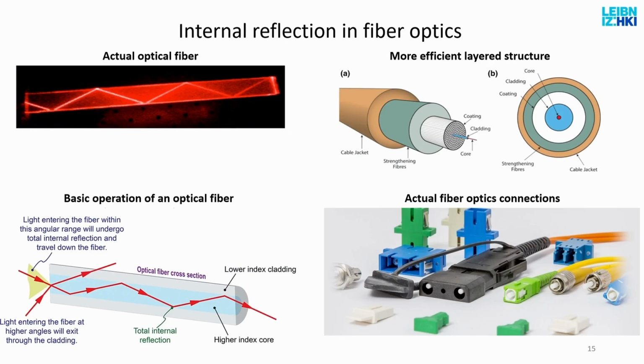But even more importantly, and in everyday life as well, this is how fiber optics is built. So the idea is you make a cylindrical shaped piece of glass, you illuminate it from the end with a laser, and then you will now know that some of those light beams will enter the tube or the filament at an angle so that they will have total internal reflection. So you illuminate, and those at a high enough angle will simply bounce around. And since it's reflection, the angle is always the same. So if you got stuck once, you got stuck forever.